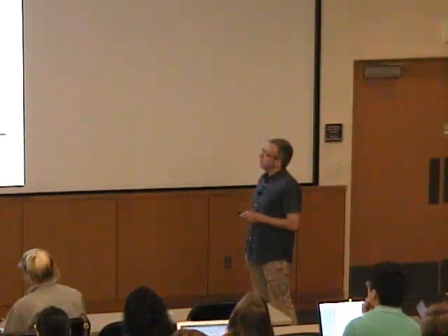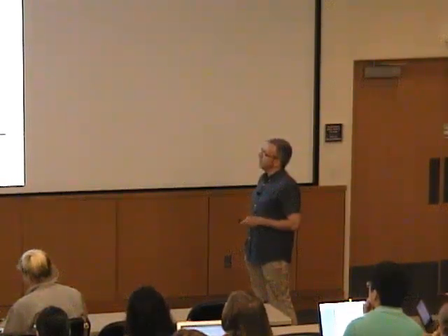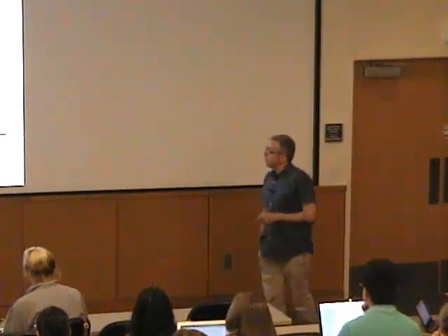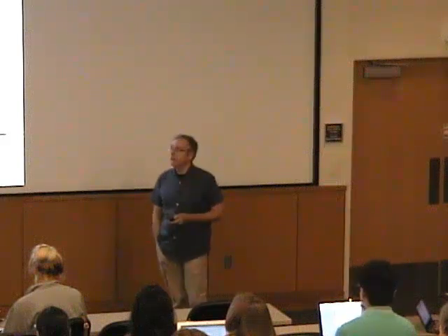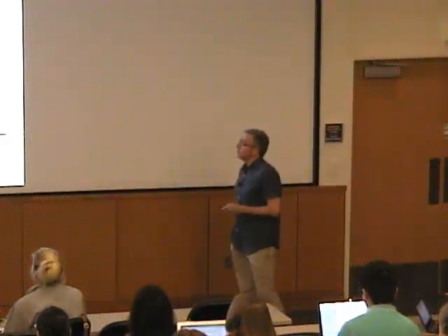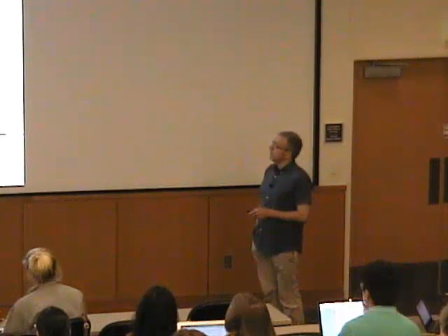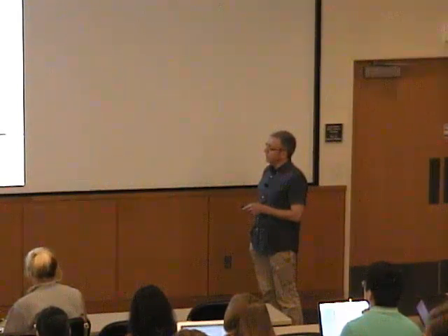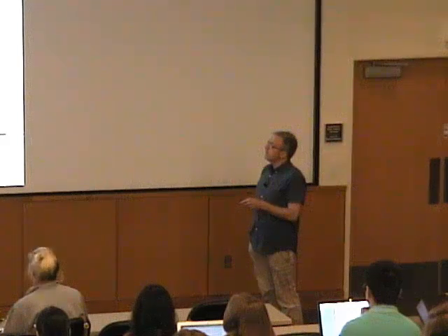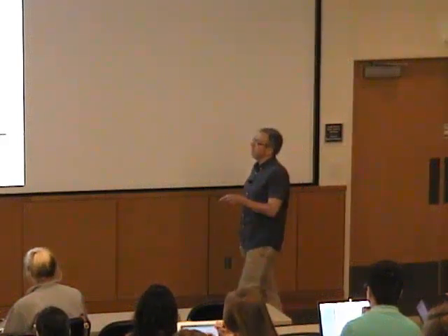So a complex number here would be represented by a value z, which has a real and an imaginary component, a and b. Okay? And of course, you can also represent it by its positional vector f, which then would have a length of absolute value of f, and it would have a phase angle of phi here. And then the real component would be f cosine phi, and the imaginary component would be absolute value f sine phi. Okay, that's how this goes, and that's what you all know, and that's how we describe waves.